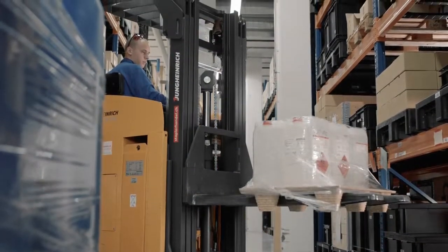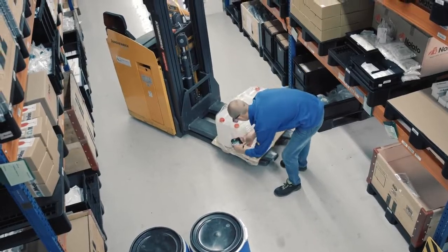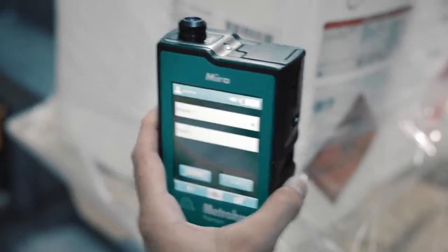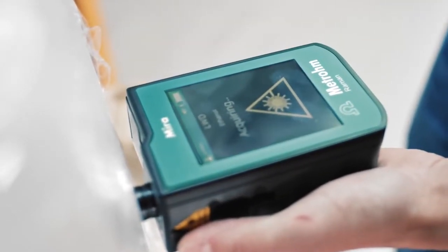Watch how fast and easy raw material verification can be — for anyone. Barcode scanned. Correct operating procedure automatically selected. Instant result at the touch of a screen.